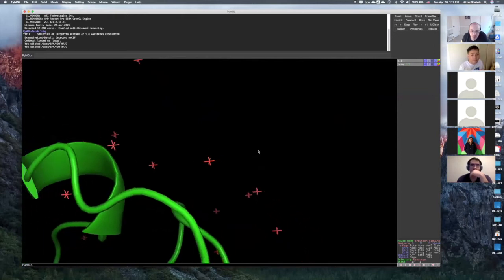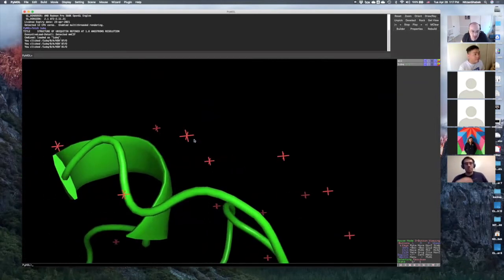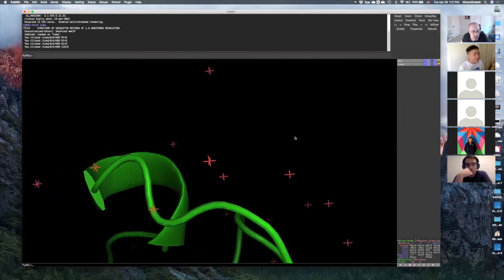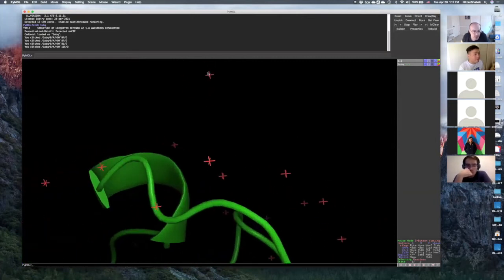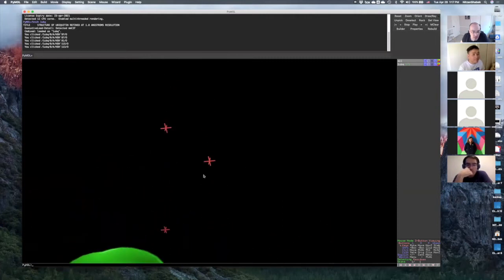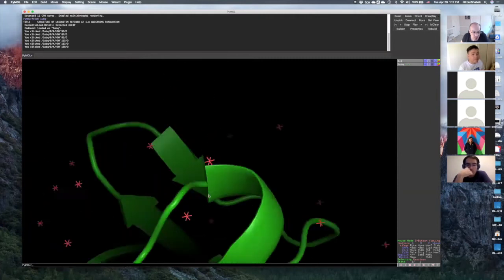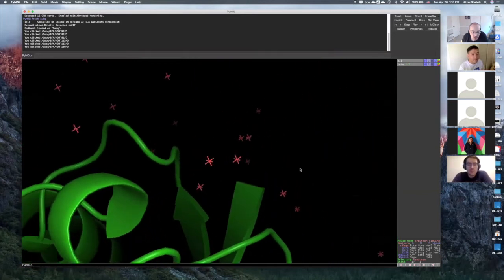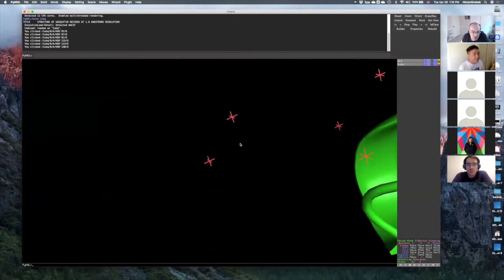Does everyone have a mouse that they can click on the middle scroller button and just press? You can center on this dot, or an amino acid or whatever. But for now, it's just the dot. So everyone can do it. You can zoom in on one and just move it around. So once you click it, that's going to be the center. Everything is going to be around this part.